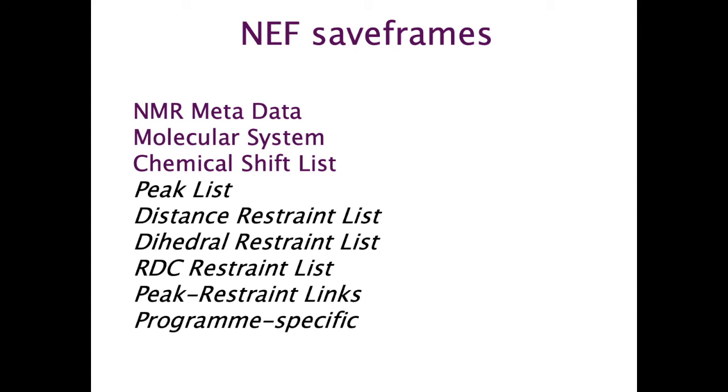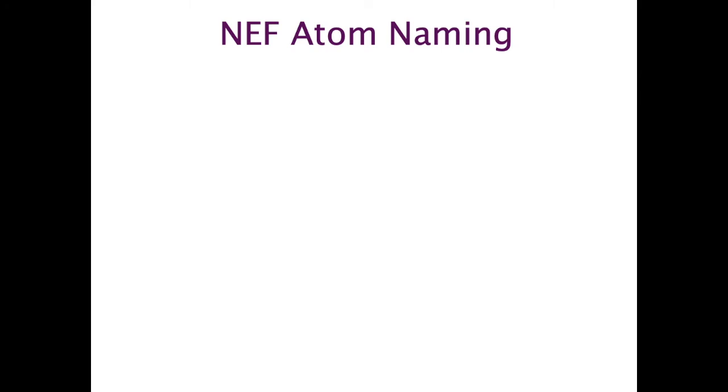In fact, at some point we may even go over to saving all of our projects as NEF files. That's a way for us to use NEF as a means to save things, but other programs can easily ignore that if they want, and they won't fall over. The other thing that NEF specifies is atom naming.